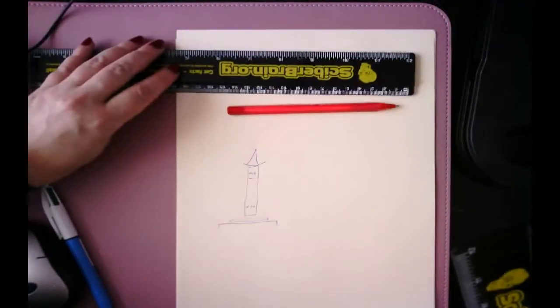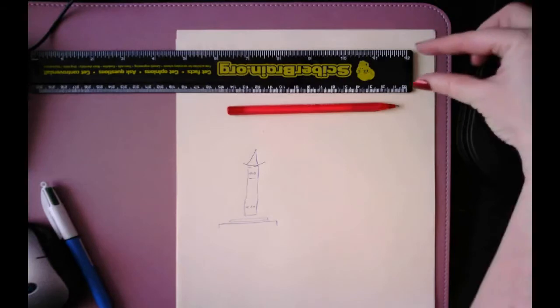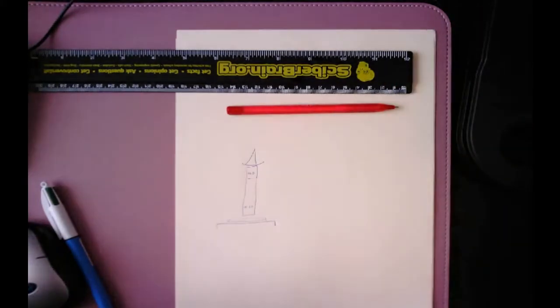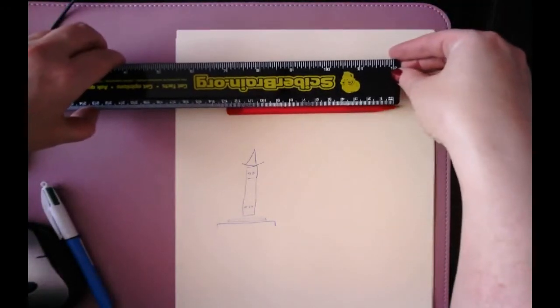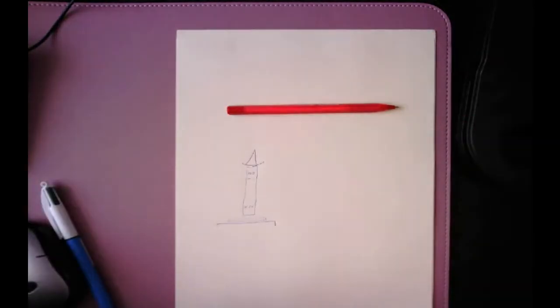Now we know that's wrong because the pen, I'm going to put this one upside down, is longer than that. In an ideal world we would do this with a microscope and put a true scale ruler right next to the object we want to look at. However, that involves using 2 different slides at the same time, and they'll be on different focal planes because you can't have them next to each other. You'd have to have one above the other, and with a microscope they will go out of focus, so that doesn't work.